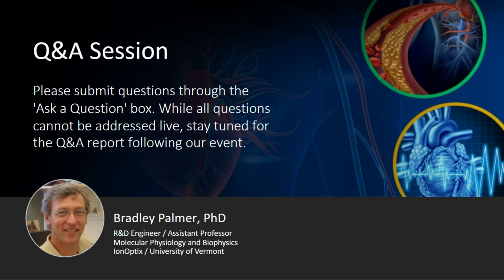Yan asks, why do the slices need to be 100 micrometers thick, or is that a personal preference?